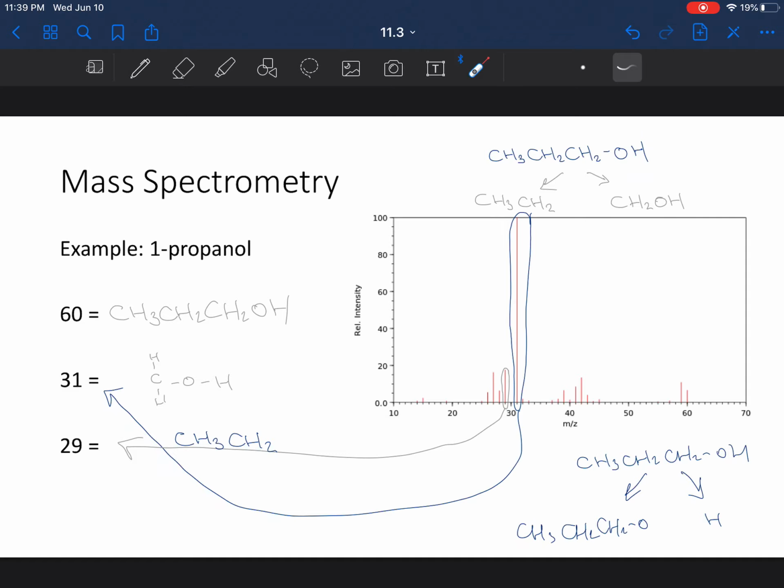Anyway, that is the whole idea of mass spectrometer. It takes a compound, breaks it into fragments, and these fragments are further analyzed by their mass. Again, this is a very good way to check to see if your IR and your HNMR are doing the right thing. So mass spectrometry and IHD are good checkers. It allows you to check to see if you are right.